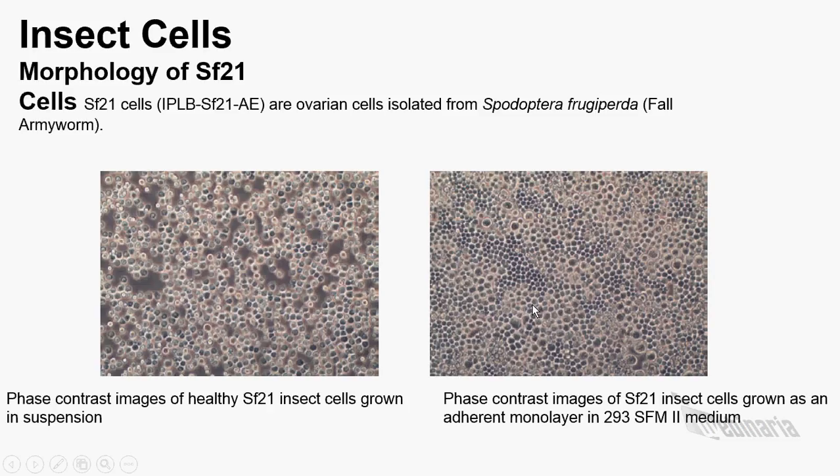In this case, you can see some very, very beautiful cells. Here you can see they are in suspension culture using SFM2 media, and, sorry, the suspension culture is here, and the adherent monolayer is here.